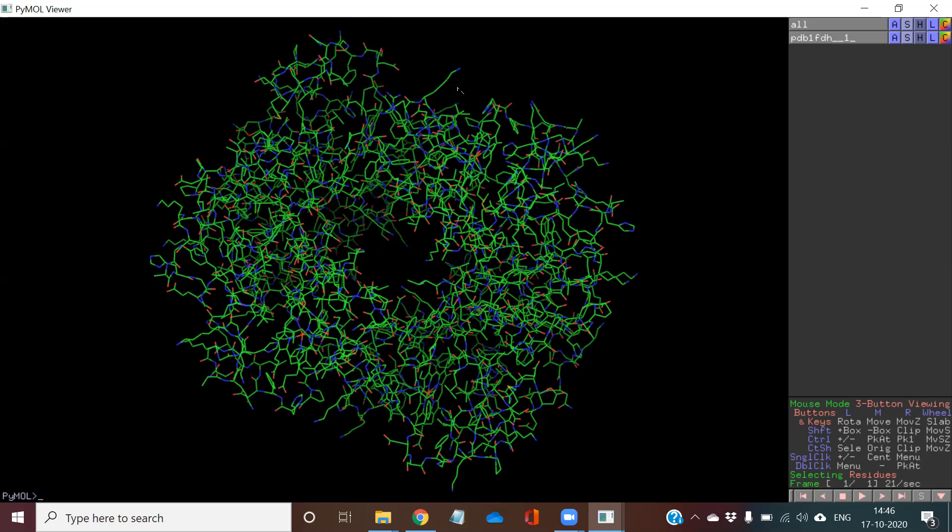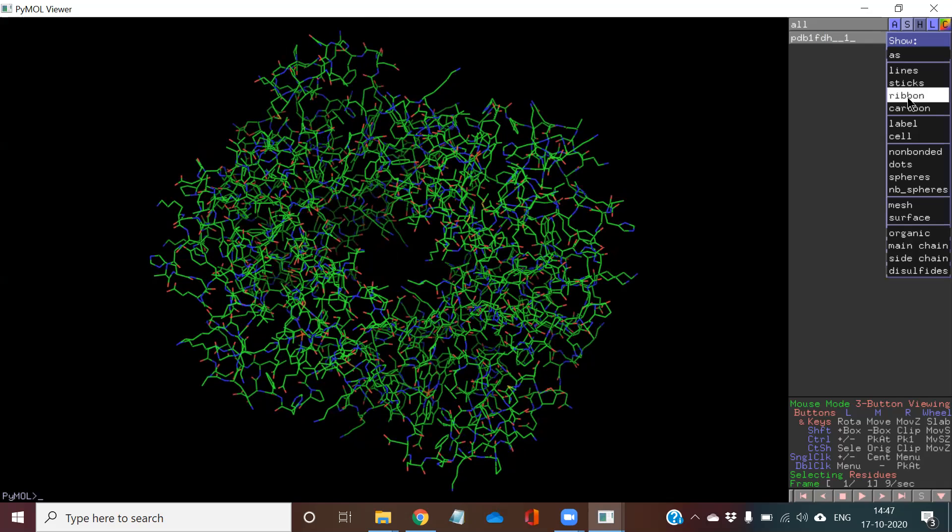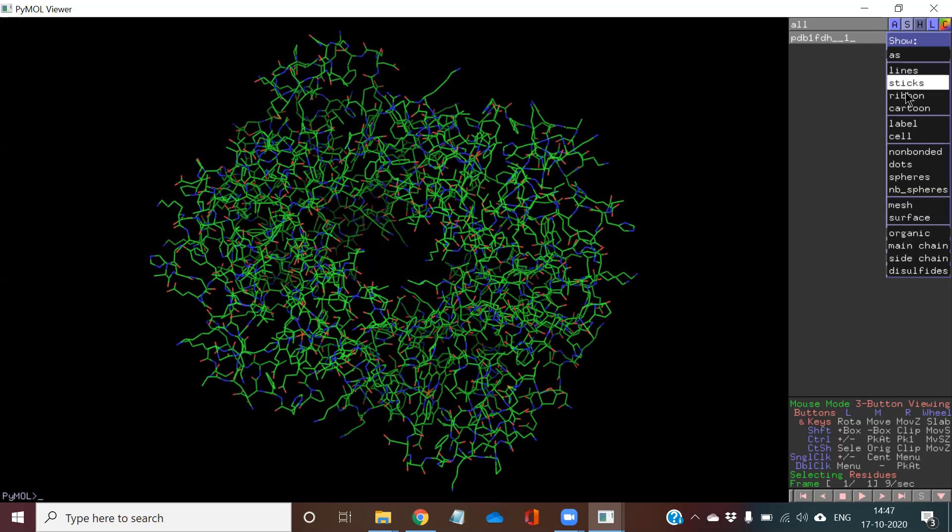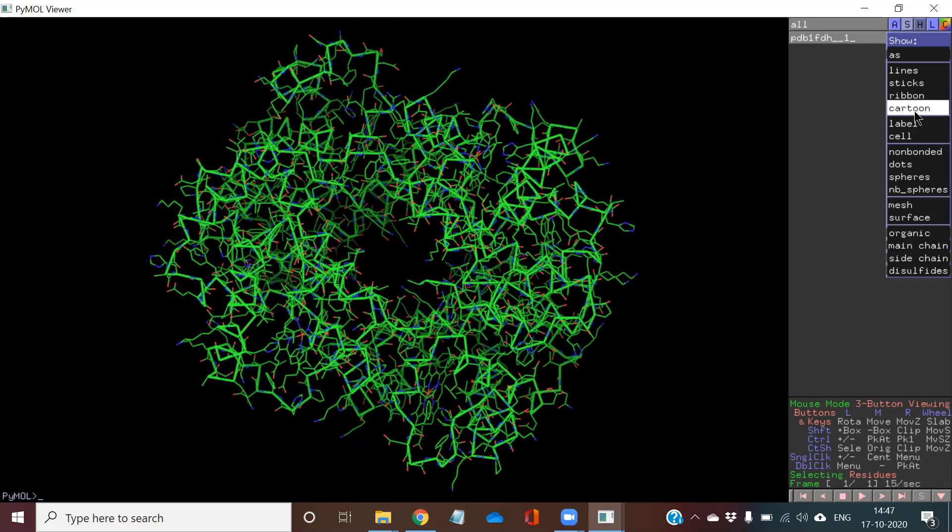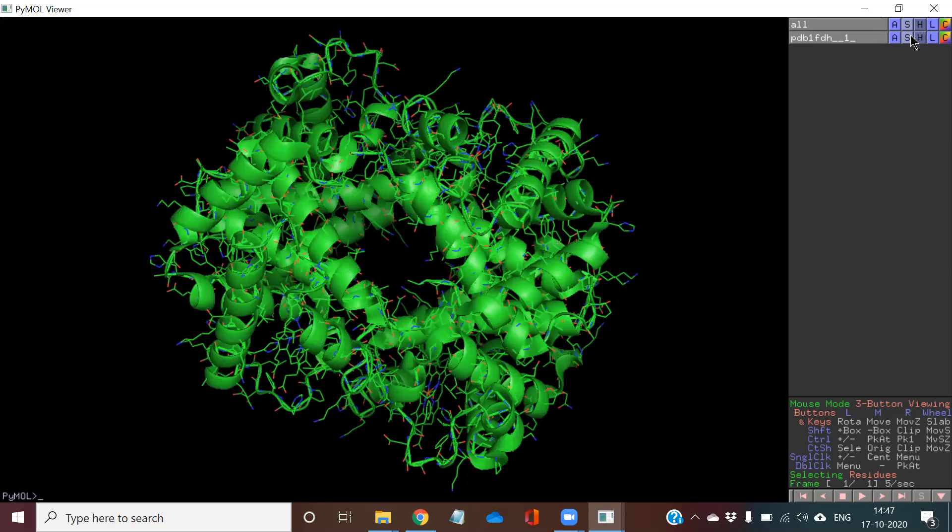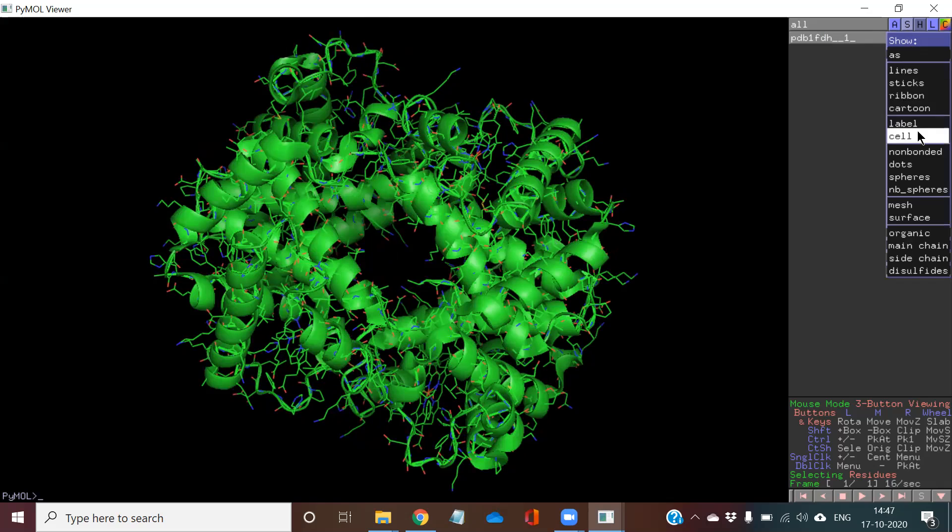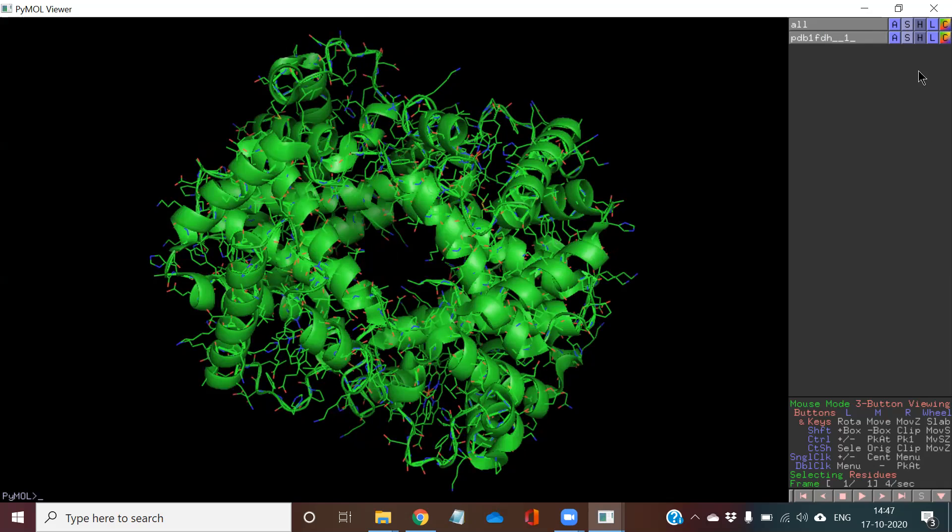If I want to change it to some other format, I will go to select and just any ribbon form. So it will become ribbon. If I want a cartoon form, it will become cartoon form. If I want it in the label form, it will become in the label form.